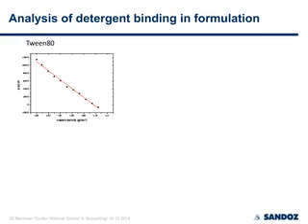And what you can do there is you increase the density of your solution by adding D2O or H2O18 to make the solution more dense, and to look at the buoyant molecular mass versus the solution density, and the intercept at 0 gives you the partial specific volume.